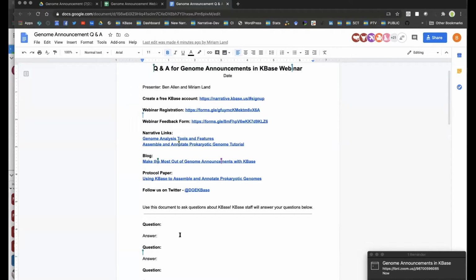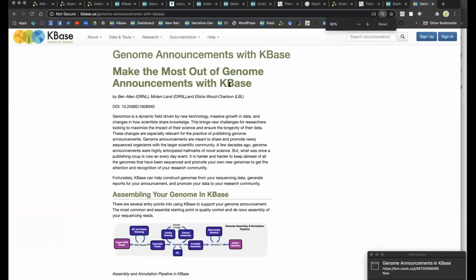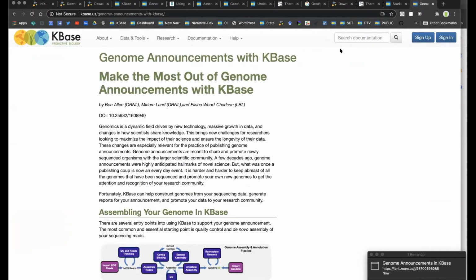So with that, I'm going to go ahead and talk a little bit about this blog that we had written here. We sent a link out to this a few months back, I think, and this is something that we're trying to do more as a project, to highlight some of the different aspects and unique features of the system in a written form.